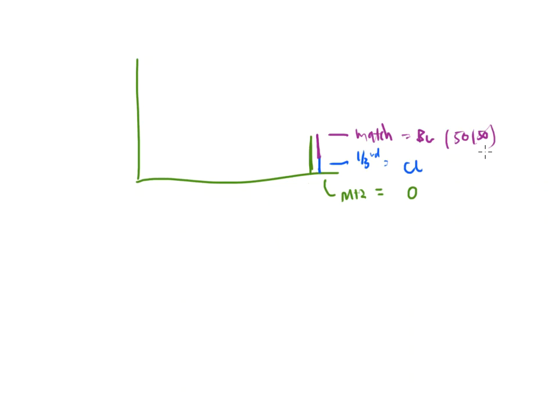All right? So by looking at the M plus 2, I will be able to quickly determine if this compound is halogenated. Specifically with bromine or chlorine, which is the most common halogen that we put on an organic. We don't really see iodine. He's too fat, too large. We don't really see fluorine because he's so temperamental and too reactive. If we do see halogenated compounds, they're typically going to be bromine or chlorine that's going to be present.